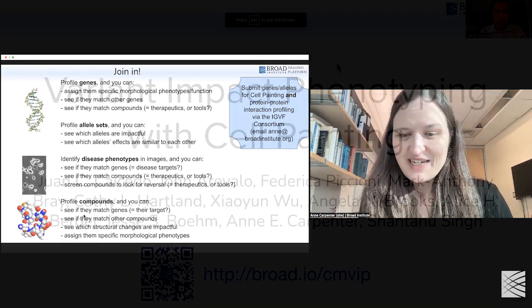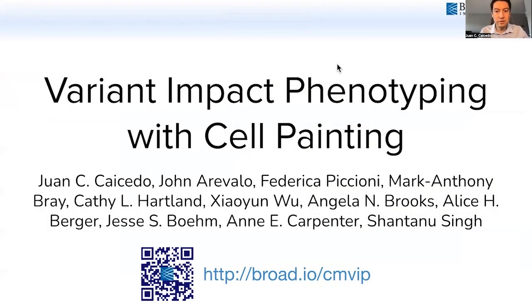All right. So this was a very nice introduction by Anne about how you can use morphological profiling for studying a diversity of problems in drug discovery and functional genomics. It's my great pleasure to present this other project in which we also used cell painting for variant impact phenotyping.